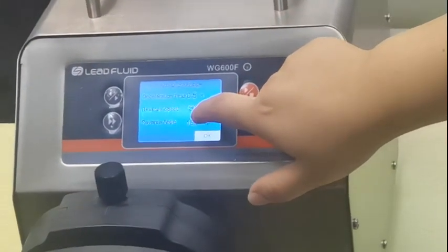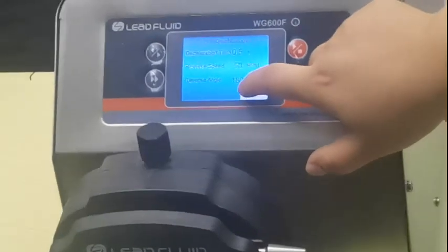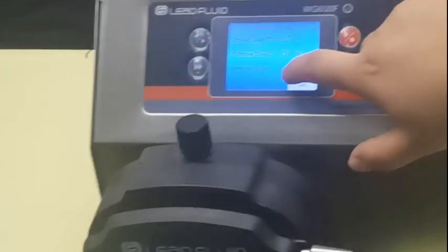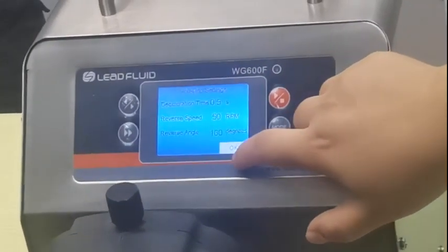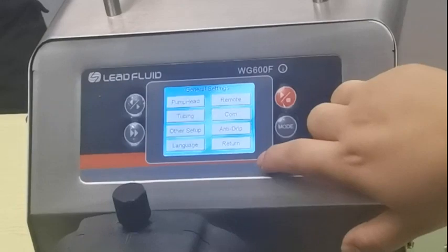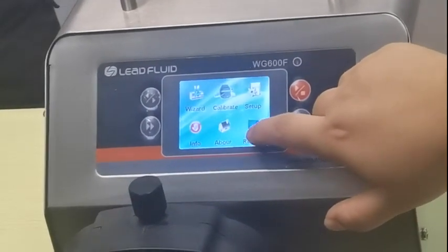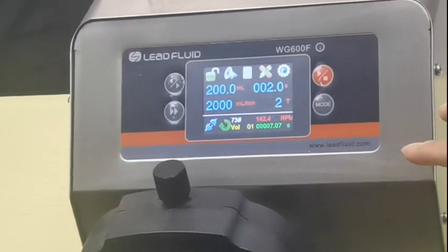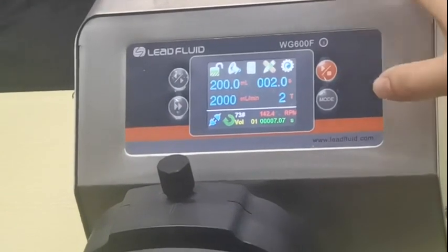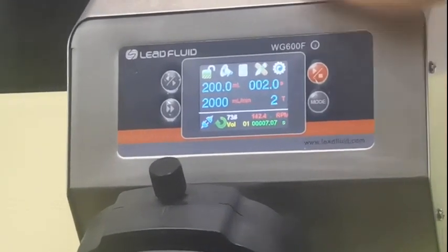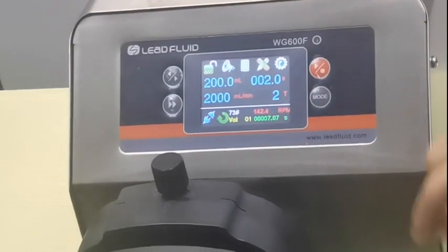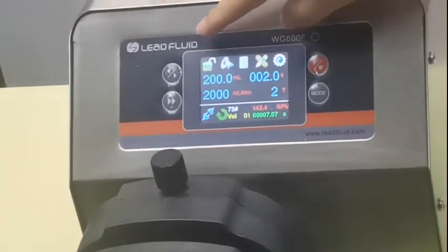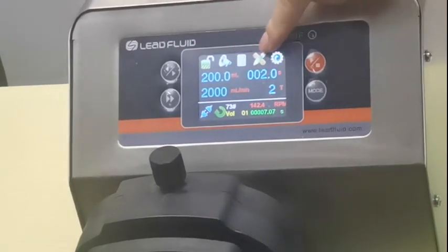You can also set up the speed and the reverse angle. That covers how to choose the pump head and the tubing in the setup. Now let's look at the main functions.